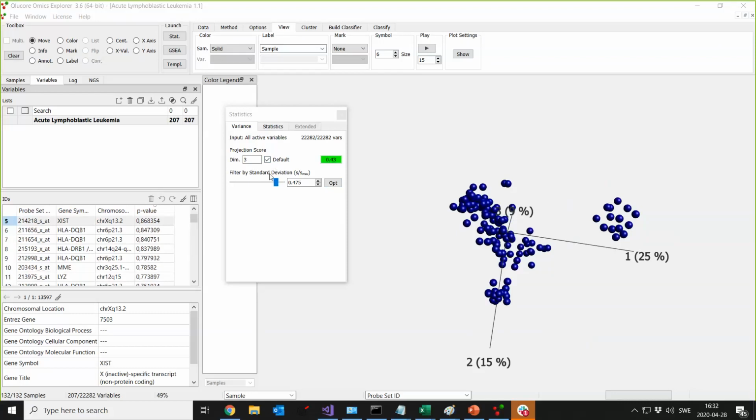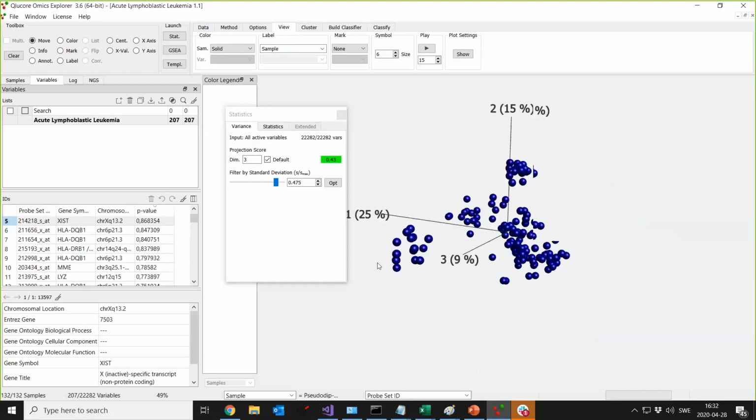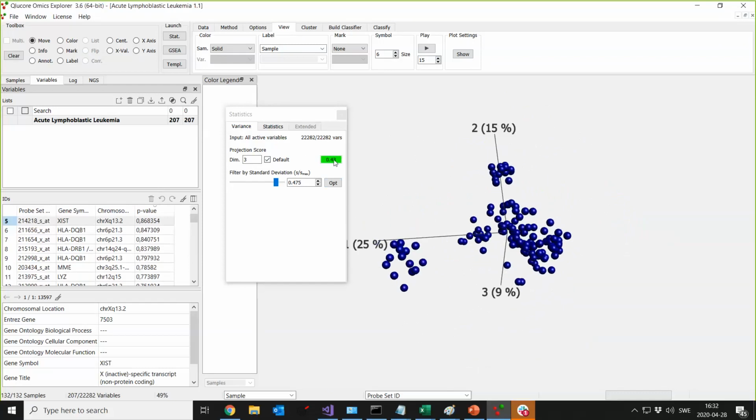What I do tell you here is that we offer this optimization to try to give you the best projection score, and the projection score is a guideline on where the variance filtering is supposedly giving you the most information. Now, it's also because there is a peer-reviewed paper describing this, which is referenced in our help in the software, and then you have a reference to why you did that variance filtering, because you see very often in scientific papers, we did variance filtering on our data and we stopped filtering at this or that value.